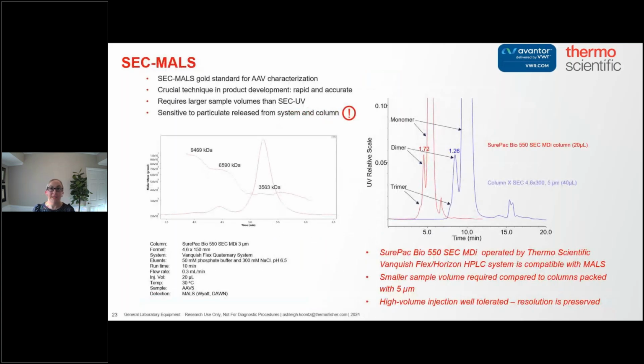So SEC-MALS is also extremely important when it comes to AAV characterization. While Thermo Scientific doesn't have a MALS within our instrument portfolio, there are other great vendors out there that do have that capability. So think about this when it comes to being able to get absolute molecular weight when there aren't always readily available AAV standards, or they're not extremely reliable. MALS can be utilized in terms of being able to get that absolute molecular weight on your AAV separations.